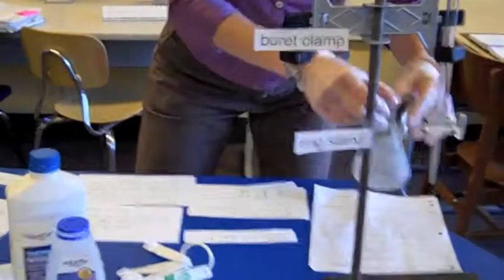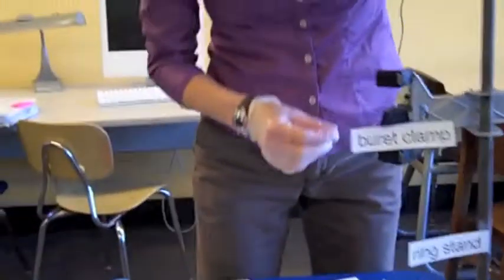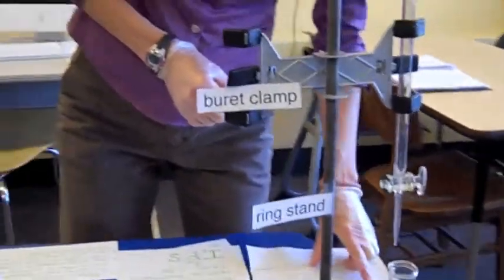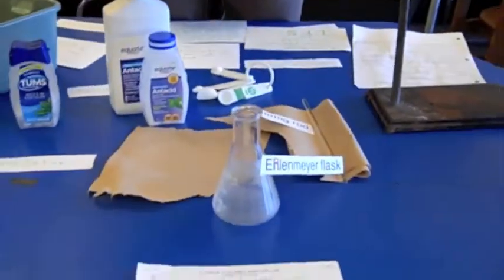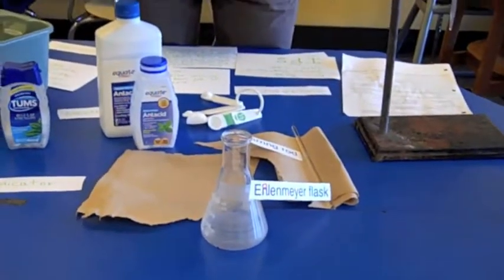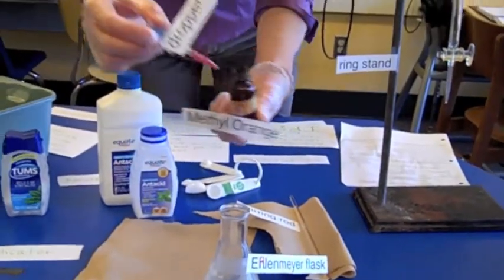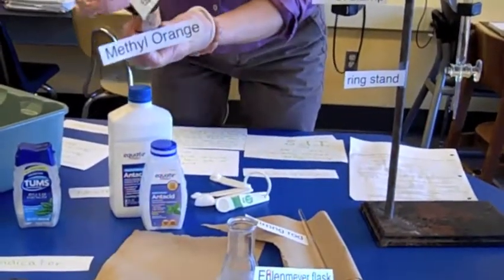Okay. What do you do next? Next, we're going to put the flask underneath this burette. Have you put in the drop? No, I haven't. Thank you. Step 5 is add 3 drops of methyl orange. You unscrew the dropper, and this is poison, so don't get it on anything. Put 3 drops right in your flask along with the water and the crushed Tums.